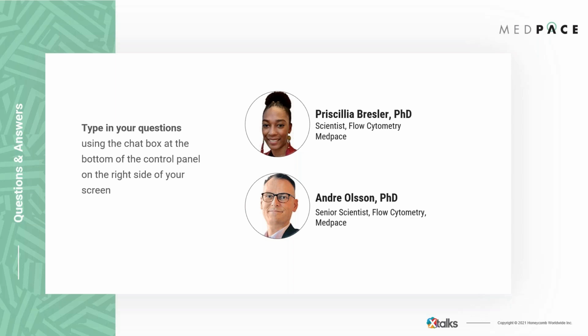Great. Thank you so much, Andre. And our next question is, for RO and whole blood, what precautions need to be taken for collection and how soon does it need to be analyzed? Can RO be done on bone marrow aspirates and biopsies?